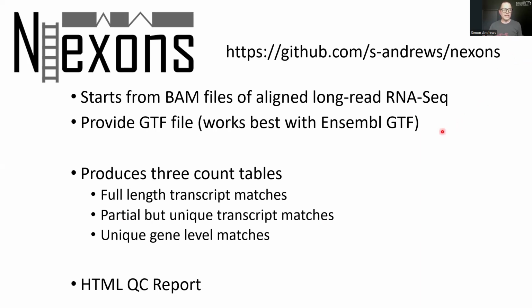The other thing you provide then is a GTF file. A GTF file describes the genes and transcripts in a gene annotation for the same genome that the BAM file was aligned against. Because of the details of some of the filtering that the tool does, although you can use any GTF file, it's really been developed with some of the conventions used in the Ensembl database. So ideally, using a GTF file taken out of Ensembl is going to give you the best experience with this.